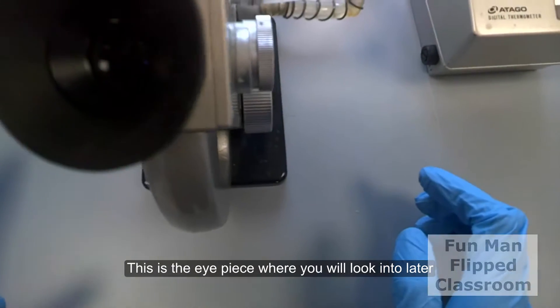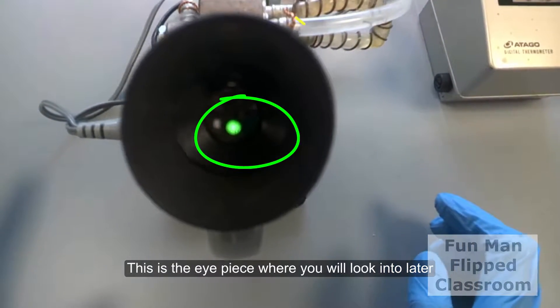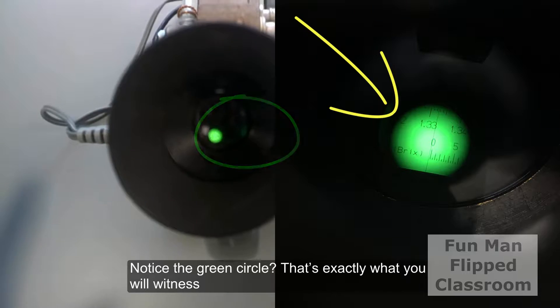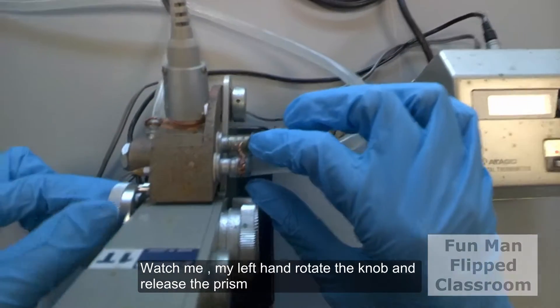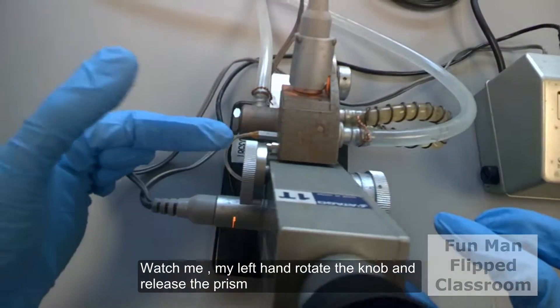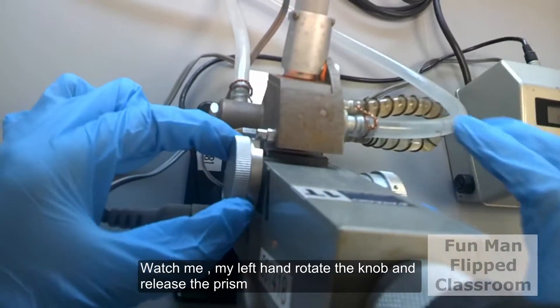This is the eyepiece where you will look into later. Notice the green circle? That's exactly what you will witness. Watch me. My left hand rotates the knob and releases the prism.